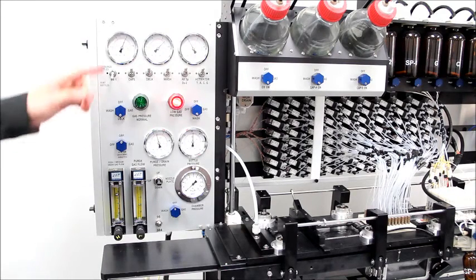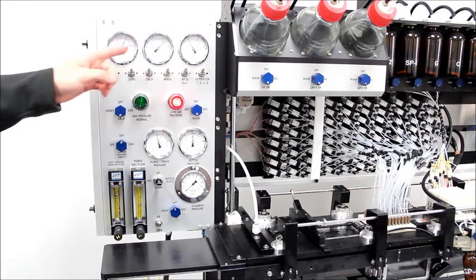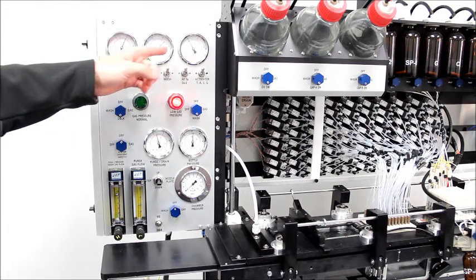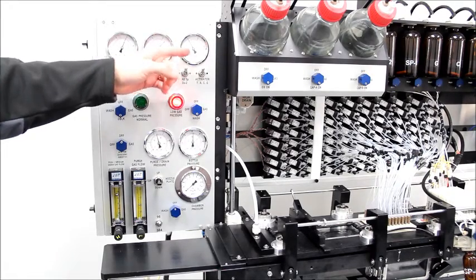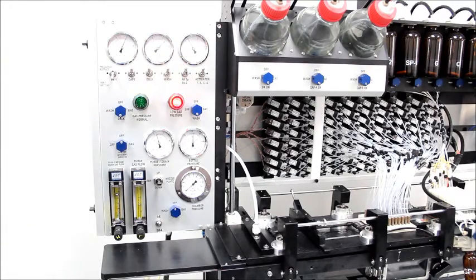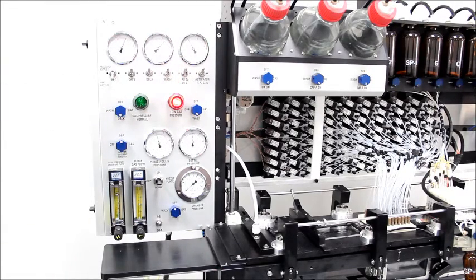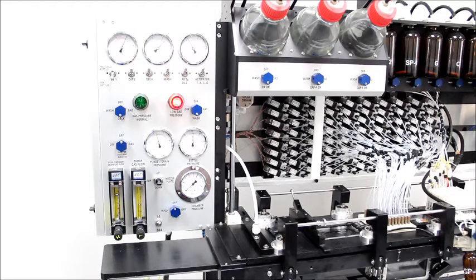Reagent bottles are pressurized to the levels shown on these three gauges. The pressure levels determine the flow rate at which reagents are delivered to the reagent nozzles.